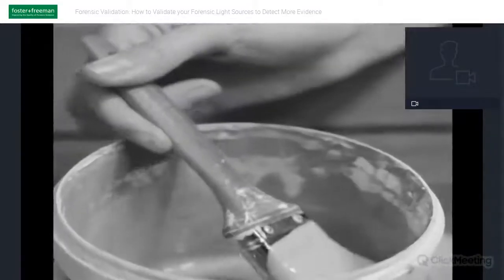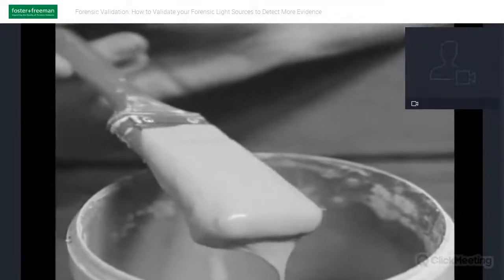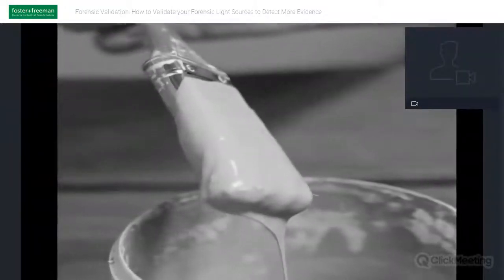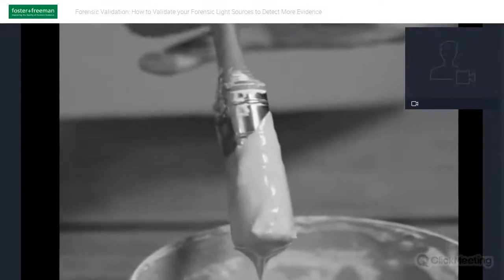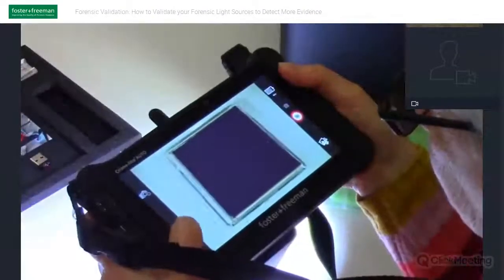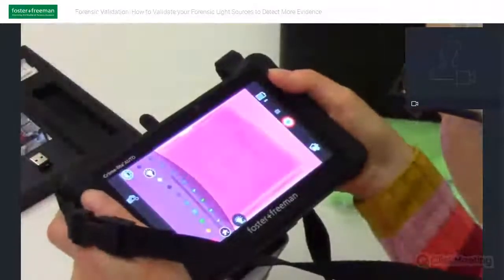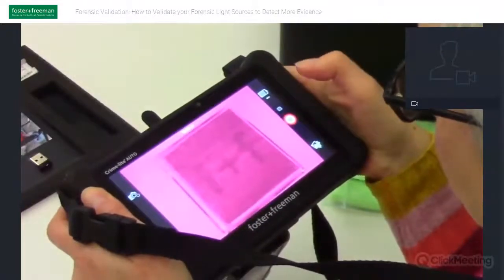This next sample is a favourite, and again based on independent research in 2018, detection of painted over traces of blood and seminal fluid. Painted over bloodstains are most easily visualised by infrared photography. Here we have used a paint that absorbs infrared and can easily be visualised under a paint that does not absorb infrared, which enables us to see through the layers of paint on the surface.